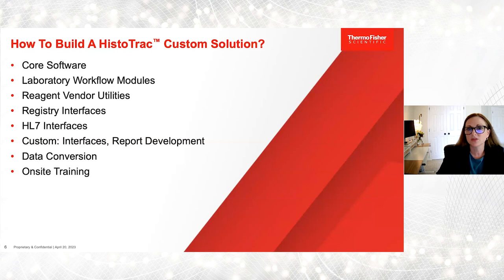So how do we build this HistoTrac custom solution? We talked about the core software. We have various modules for lab that will help establish a laboratory workflow, reagent vendor utilities, those registry interfaces, HL7 interfaces. We build lots of custom interfaces or custom report development. We do data conversion, and we do on-site training. All of this would be part of the process that we would help you go down that discovery to learn what it is that you need to make this solution yours.